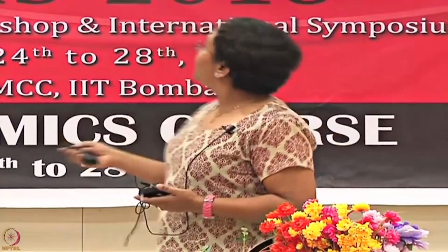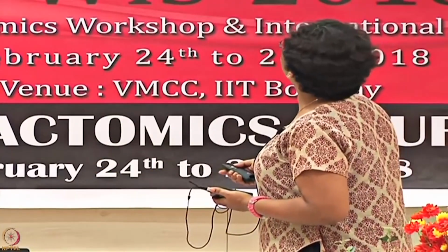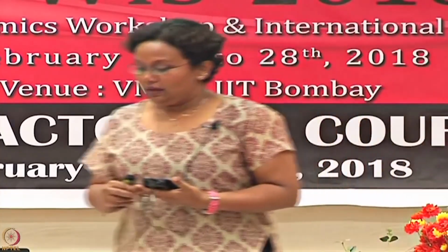If you do not see any rise at pH 5.5 and 5, and suddenly you see a rise at 4.5, that is where you go into a lower pH like 4.4, 4.5 or 4. Otherwise, stay close to a more comfortable environment. Does it make sense? Okay.